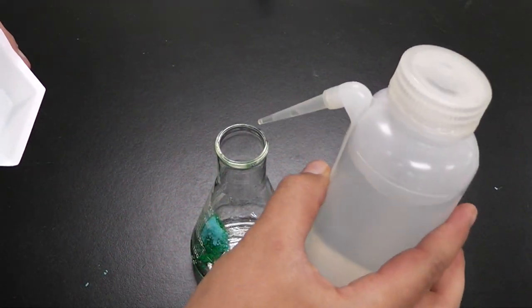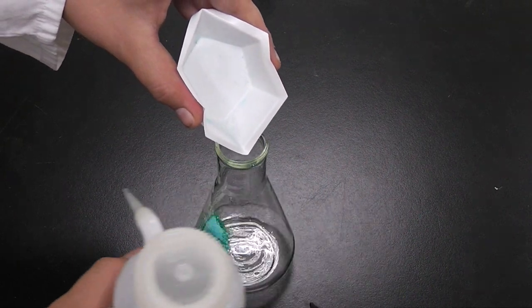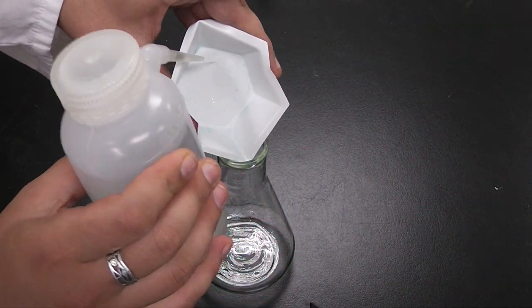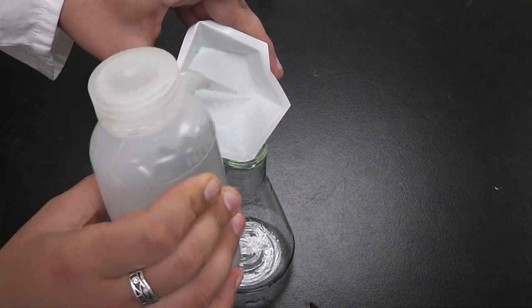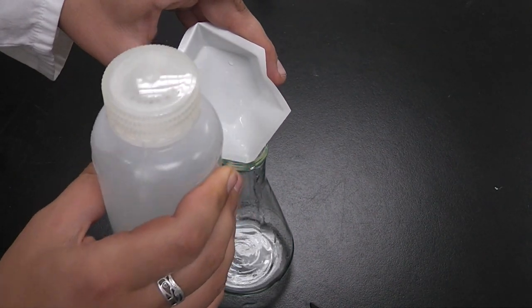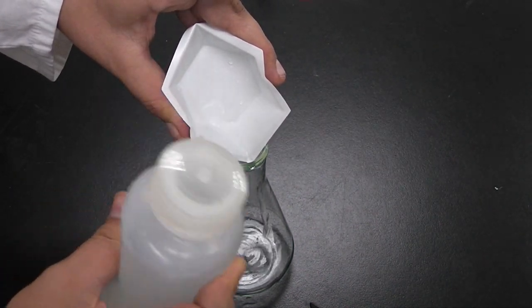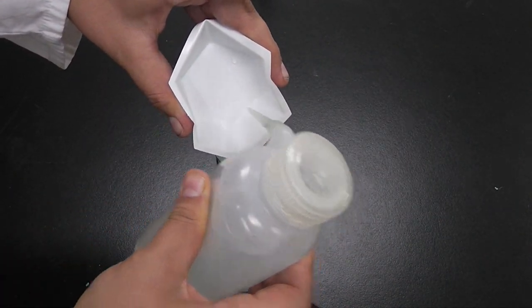When you've done that, grab a wash bottle with deionized water, touch the weighing boat to the Erlenmeyer flask, and gently wash in all of the sample. You don't want to use too much water here, just enough to get the job done.